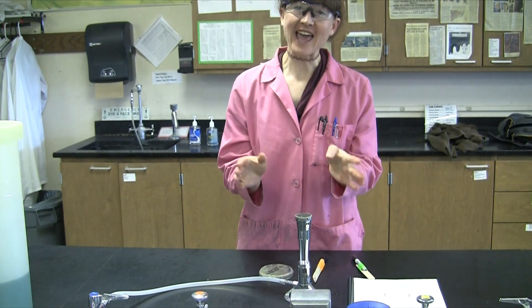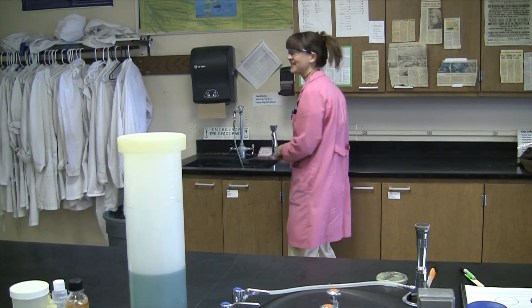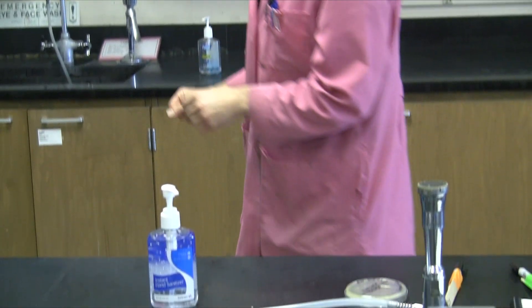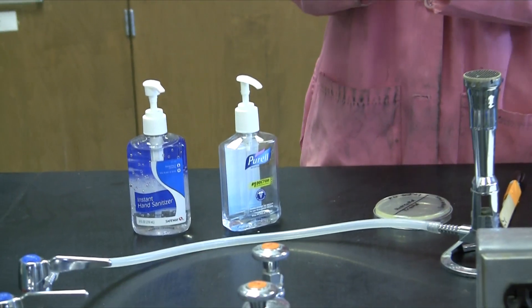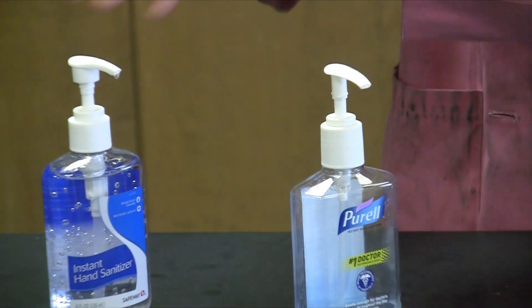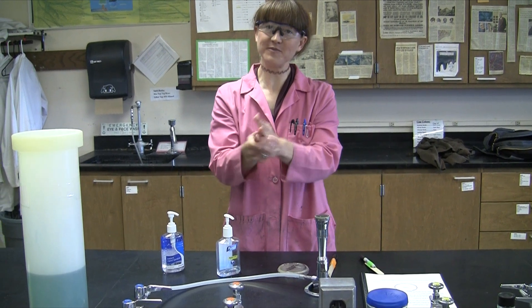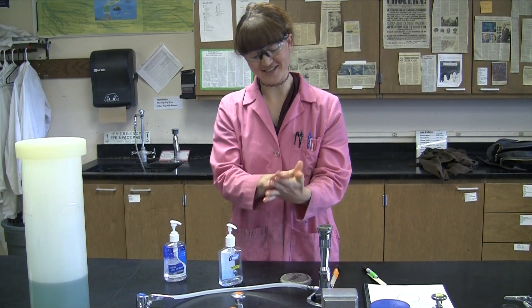Alternatively, some of you may be using hand sanitizer. For hand sanitizer you'll do the same sort of thing — today I have two different brands, one generic hand sanitizer and the other is Purell. Do the same kind of mechanical action, only you're not using water. Just do a pump or two of hand sanitizer and scrub it around all over, doing the same sort of action as hand washing.